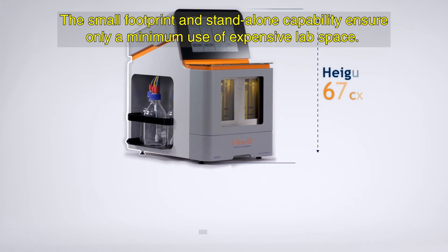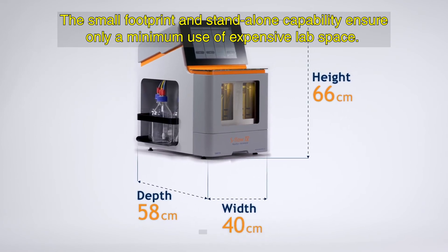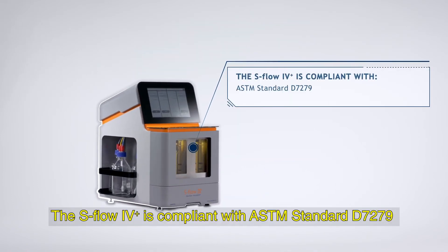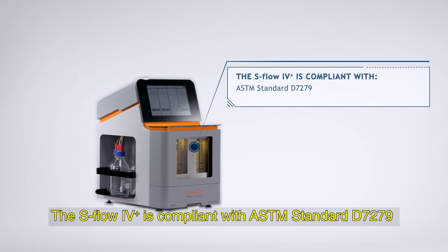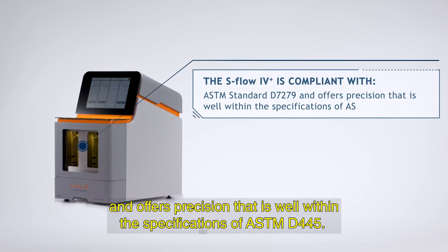The small footprint and standalone capability ensure only a minimum use of expensive lab space. The S-Flow 4 Plus is compliant with ASTM standard D7279 and offers precision that is well within the specifications of ASTM D445.